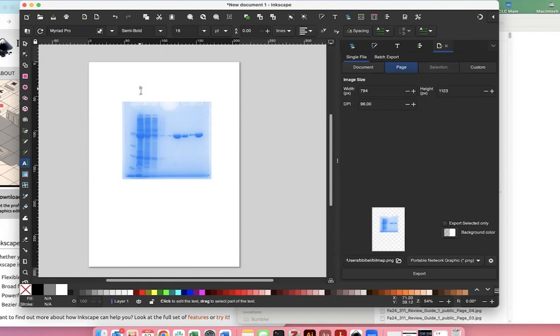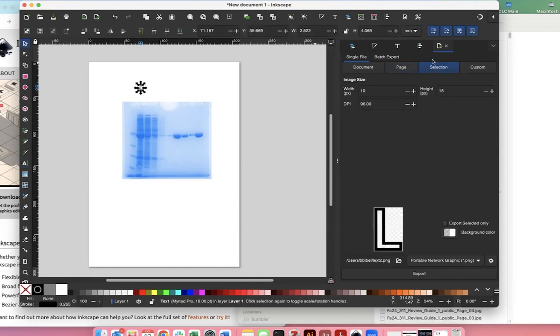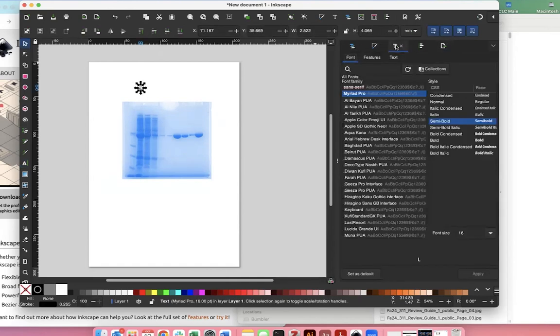You can see that it made a weird text. It's got an outline instead of a stroke. It's all messed up. Let's fix that. If I come over here, I can see some various options. I'm going to go to this T. It's going to tell me the text. Here's where I could set the font. If I go down here, I can see that right now I have fill as none and stroke as black, where what I really want is fill as black and stroke as none.